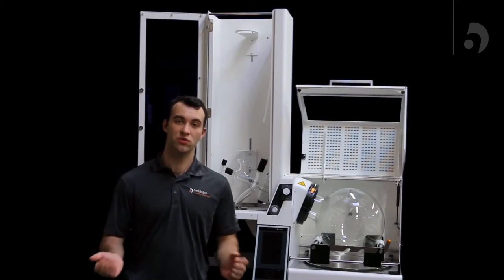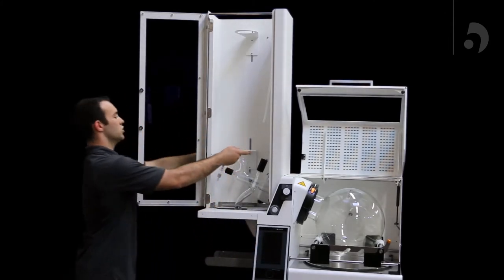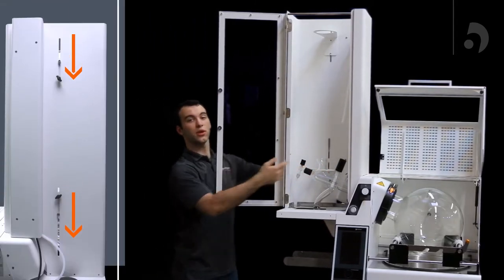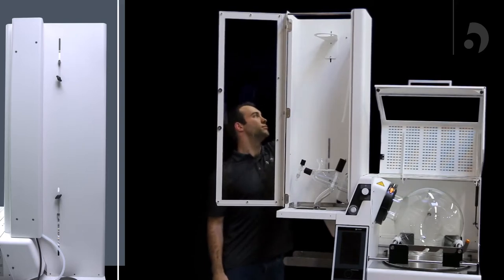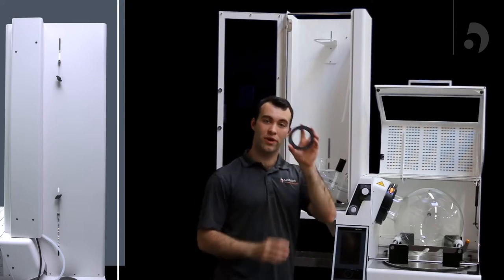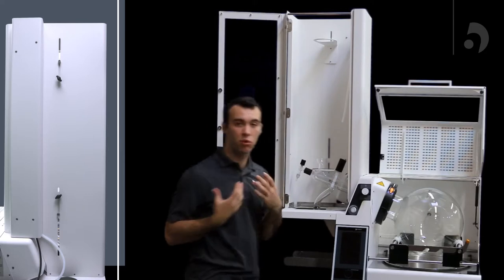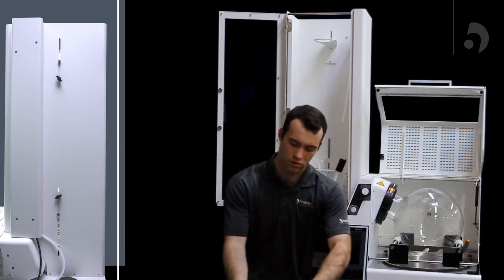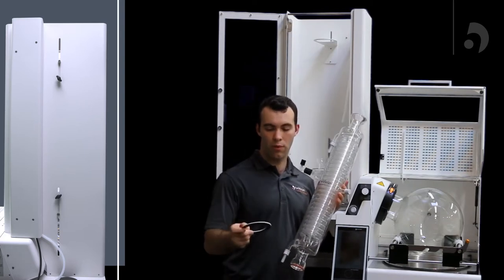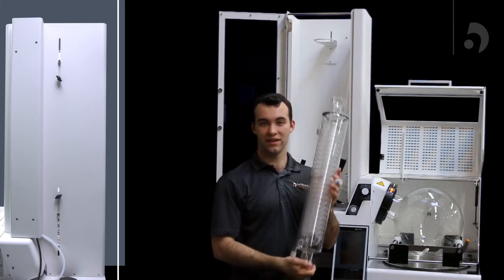The next portion of our assembly is going to involve our condenser. Lower both supports on our housing to the lowest point. Once we've done that, we can take the first rubber ring, rubber side facing up, and put it on the bottom support. Now we're going to take our condenser and put the upper rubber ring on the top, also facing the condenser.